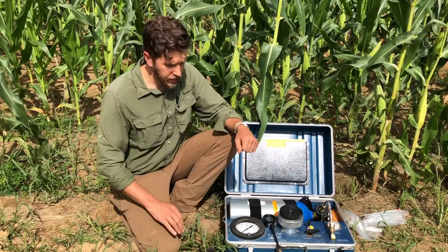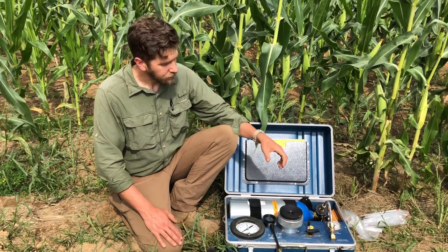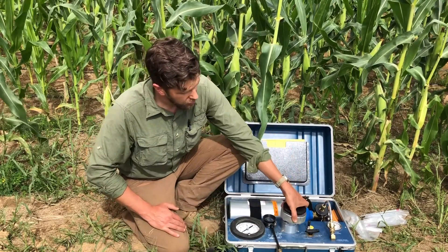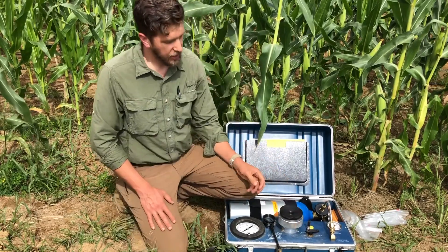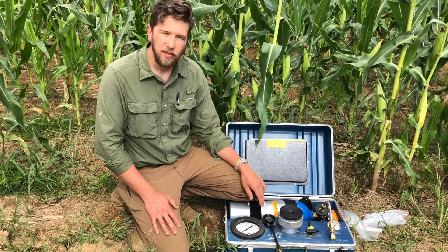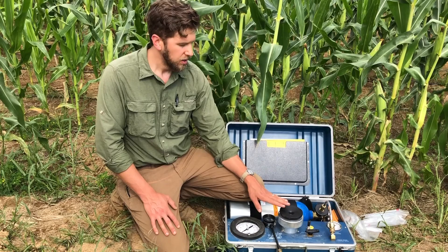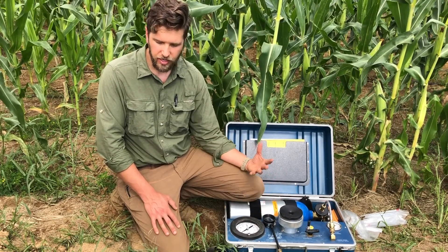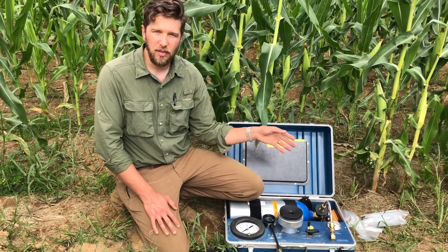This device is able to measure that negative tension by taking a leaf sample and placing it in a pressurized chamber. What we're measuring is the amount of pressure it takes for xylem sap to be extruded out of a cut surface of that leaf, and that amount of pressure is equal and opposite to the amount of negative tension that exists throughout the entire plant.